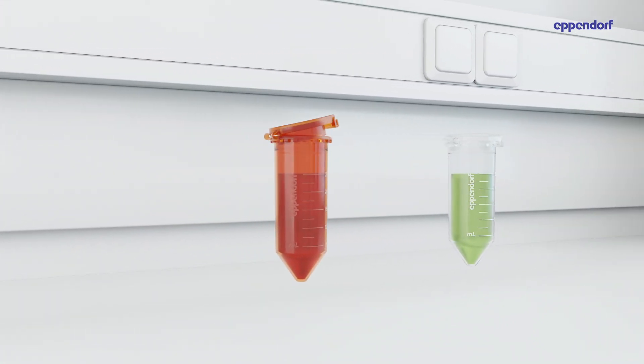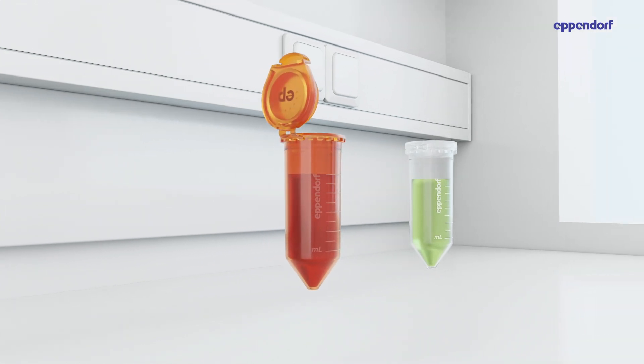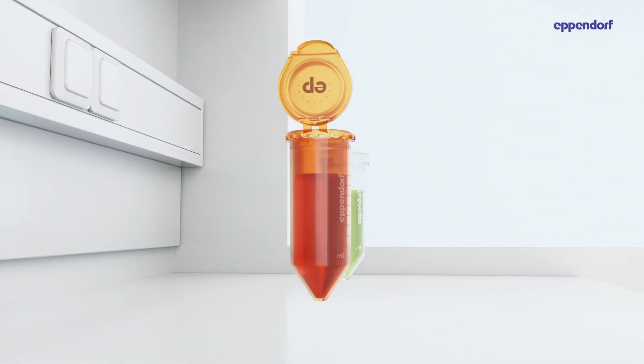The majority of amber tubes have a major drawback, however. They are opaque and do not allow direct sample visibility.